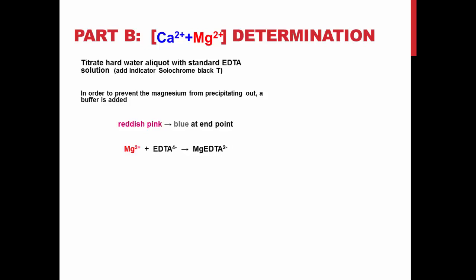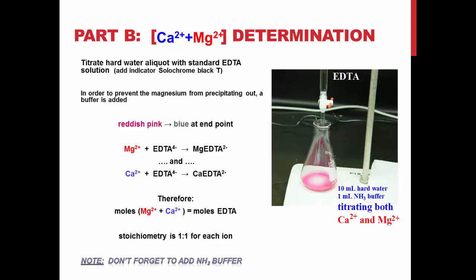Part B, the determination of calcium and magnesium concentration. This time, we will be titrating the hard water aliquot with standard EDTA solution and adding the indicator eriochrome black T. Note, we will not be precipitating out magnesium hydroxide. Again, this will turn from reddish pink to blue at the endpoint. Note that both magnesium and calcium have a 1 to 1 ratio with EDTA. Therefore, the moles of both magnesium and calcium will equal the moles of EDTA. Don't forget to add the ammonia buffer.